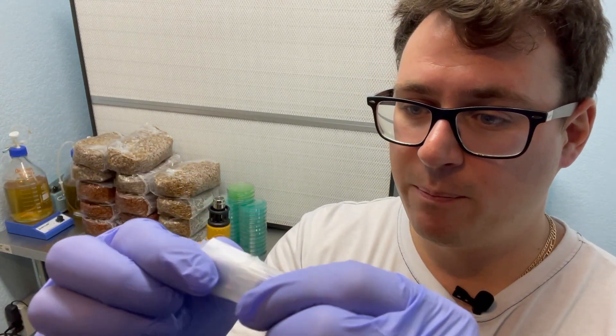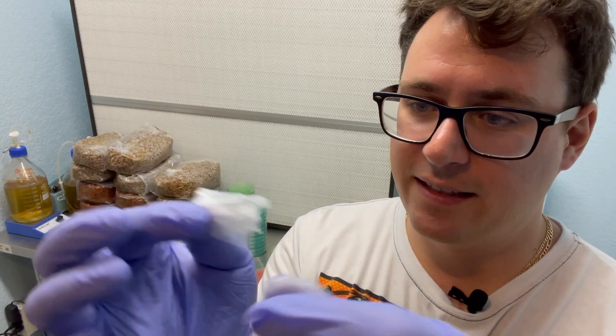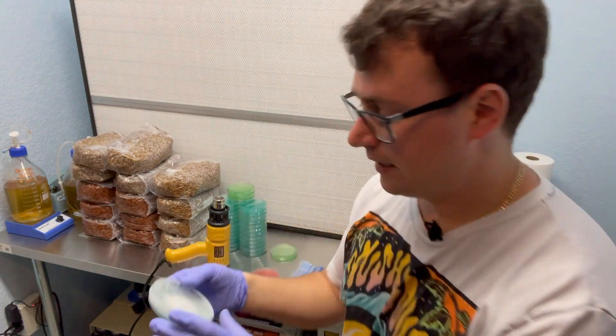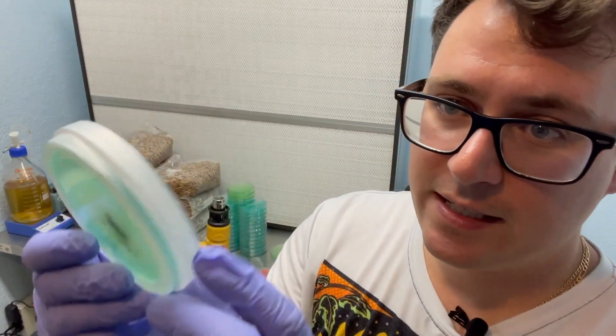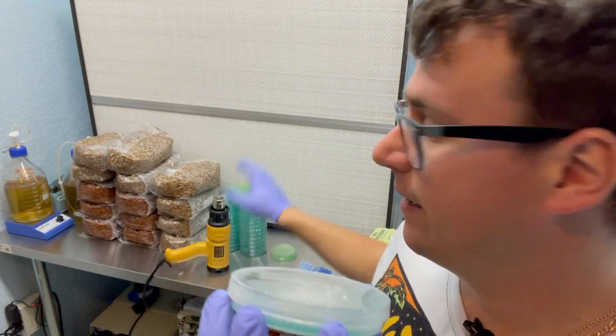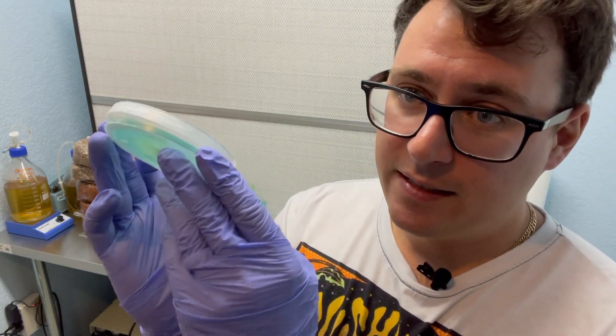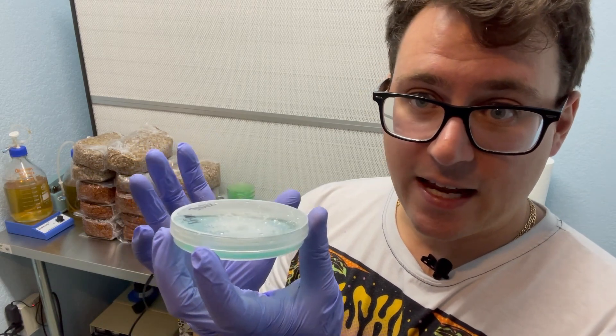One of the problems with parafilm, besides that it rips pretty easily, is that oftentimes a lot of condensation will build up. This is a lion's mane culture, and you can see it's parafilmed. Just by bringing it out of the incubator and setting it on the surface, it created a little condensation. One of the claims for shrink wrap over parafilm is that it mitigates this condensation. In my opinion, I think temperature is more of a factor than the sealing material, but we'll put that to the test right now.